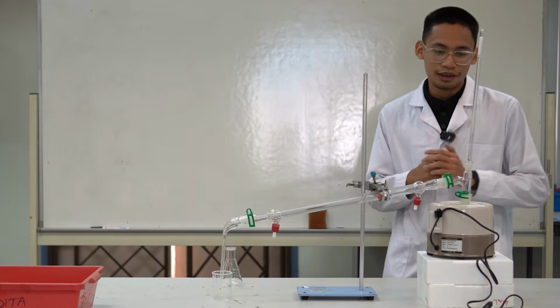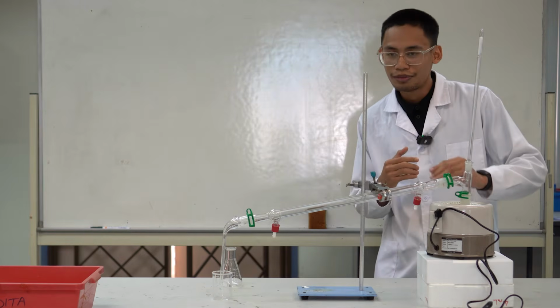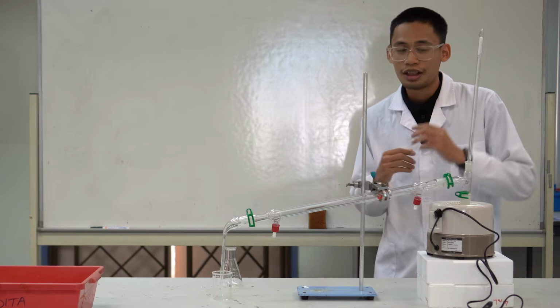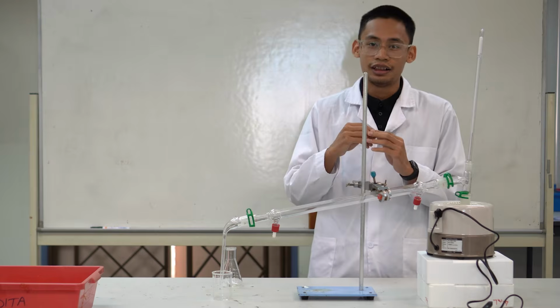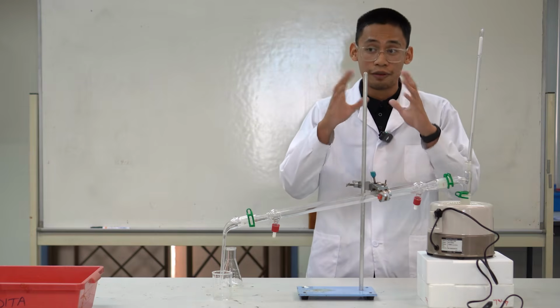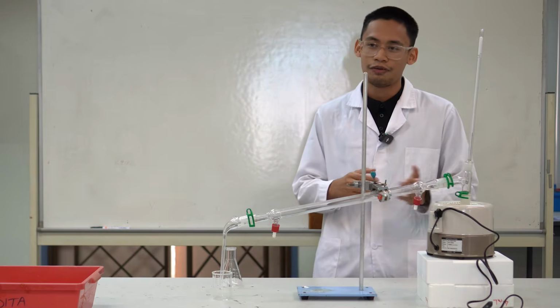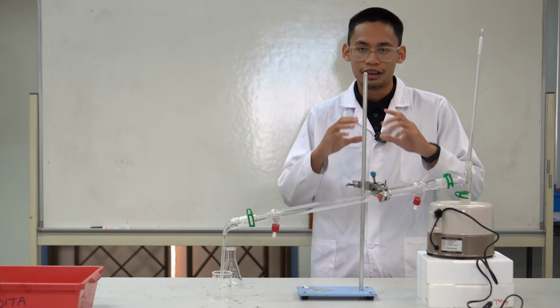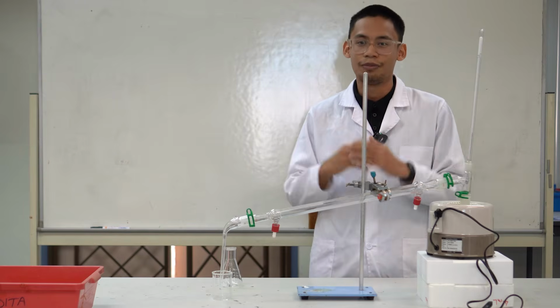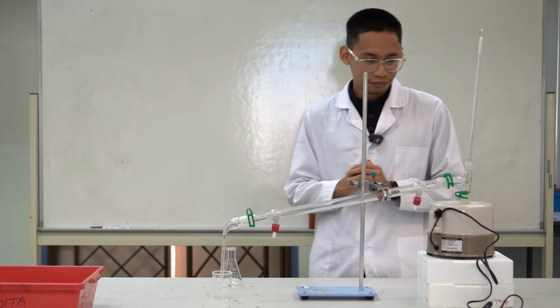The third part is the thermometer. As you know, when we heat up the mixture, it will vaporize. So the function of the thermometer is to measure the temperature of the vapor, not the liquid, the vapor. For our case, if we use DCM and base, the thermometer will measure the temperature of DCM because it has a lower boiling point compared to the base.